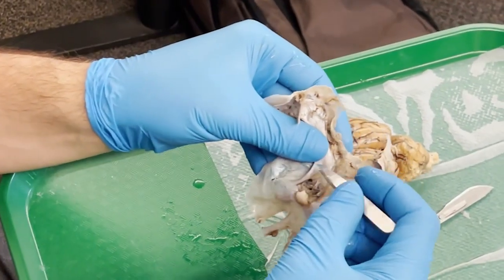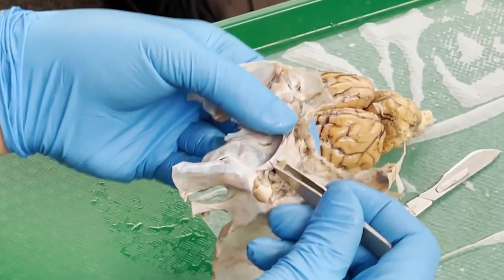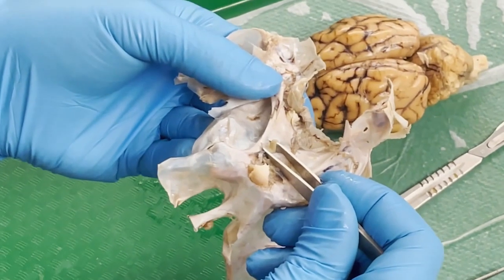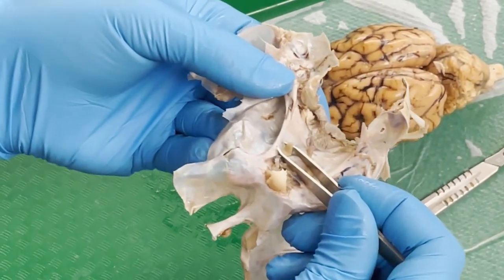So, sorry, nervous tissue like axons or fiber bundles. Like for instance, there's a little bit sticking up right here. That is part of one of the many cranial nerves.